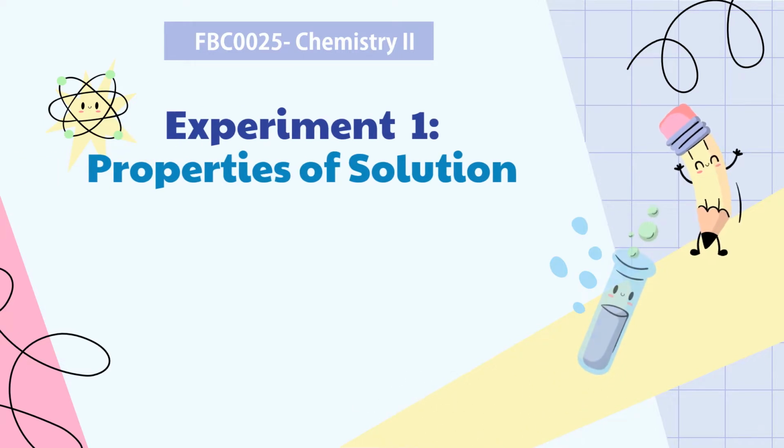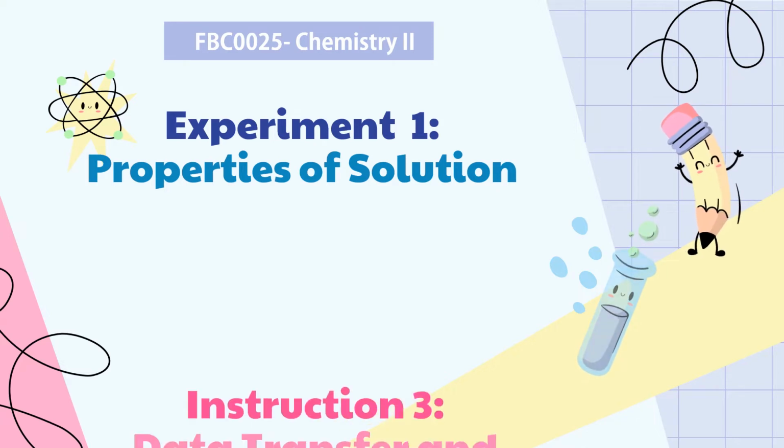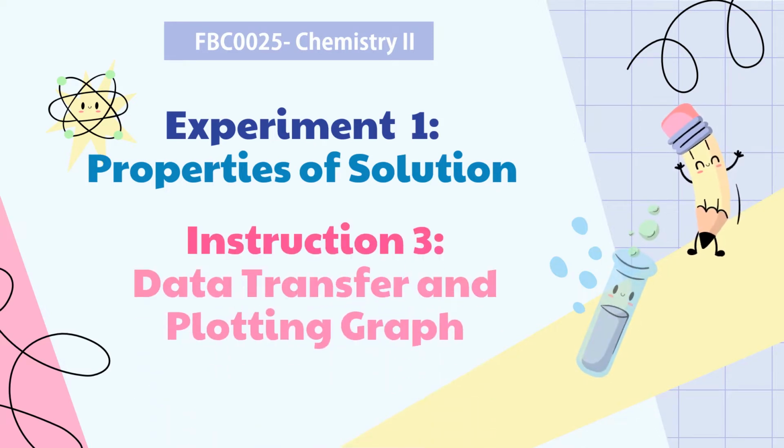Now you are doing the experiment 1 on the properties of solution, and I will share with you on the instruction 3, how to do the data transfer and plotting the overlay graph.